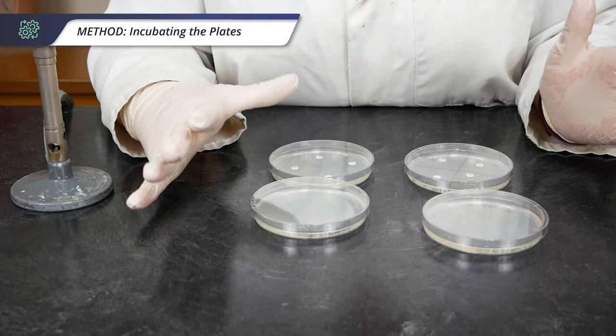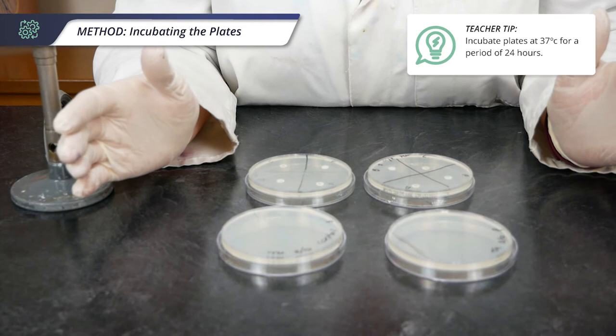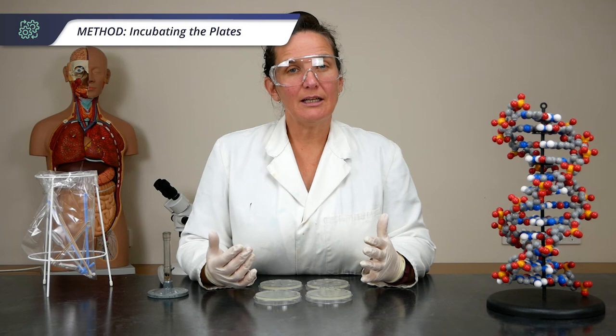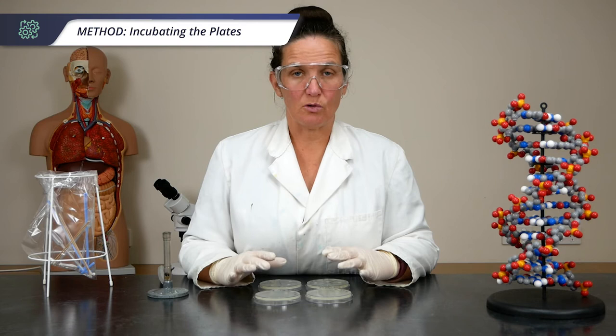Now that we have our plates all inoculated and with antibiotics in them, we will turn them upside down. They will be incubated for 24 hours at 37 degrees Celsius. There is a temptation to incubate at a lower temperature, but it is actually safer to do it at 37 degrees because the faster your E. coli grows, the less time you have for possibly pathogenic contaminants to also grow.